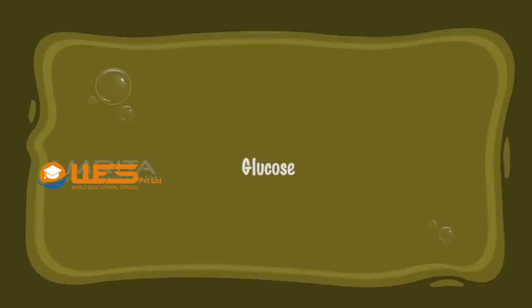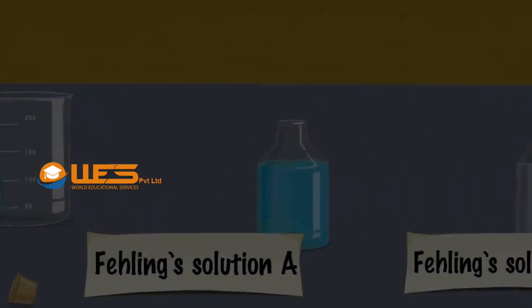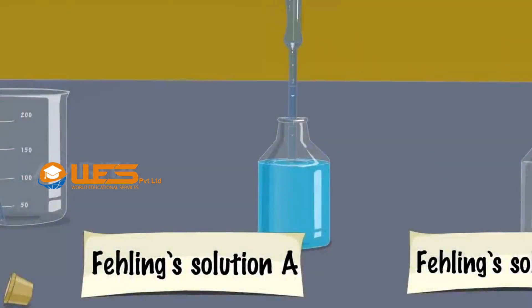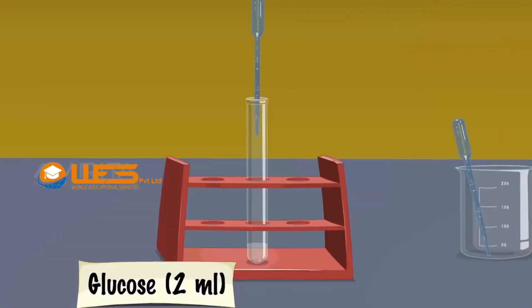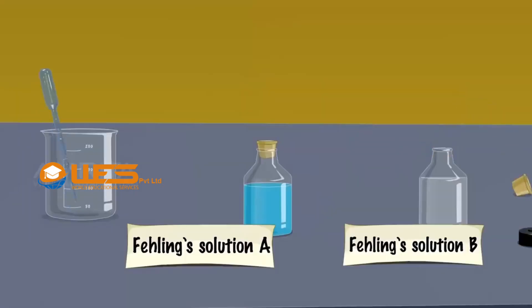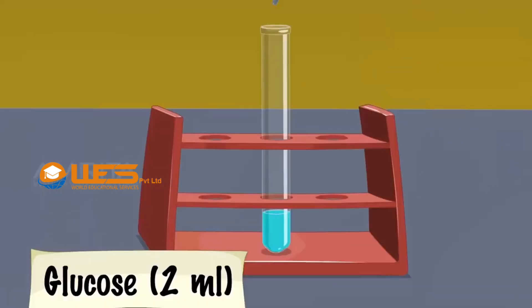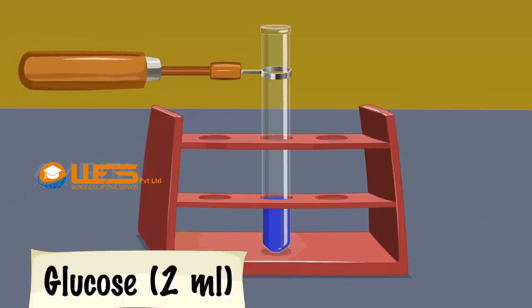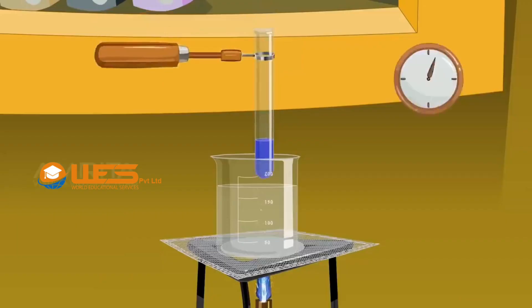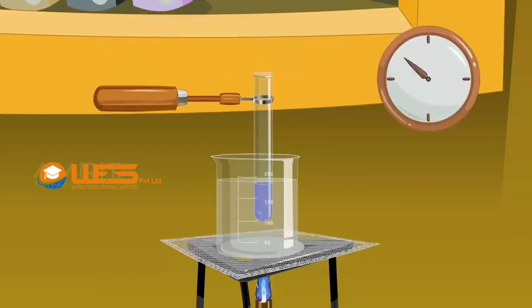Fehling's Test. Glucose. Take 2 ml of Fehling's solution A using a dropper. Add it to 2 ml aqueous solution of glucose taken in a test tube. Then add 2 ml of Fehling's solution B into the test tube. The solution turns a deep blue colour. Remove the test tube from the rack using a test tube holder. Place it in a boiling water bath and heat for a few minutes.